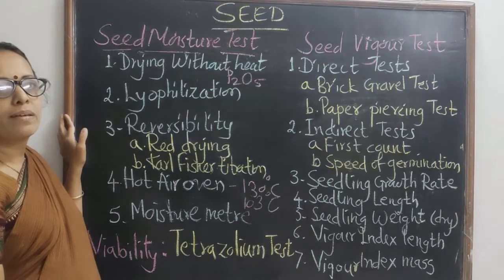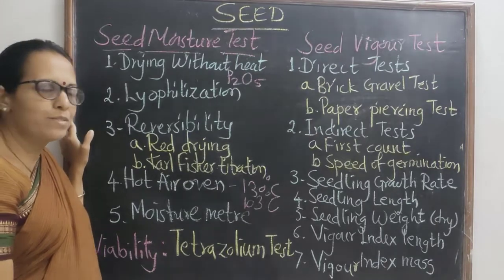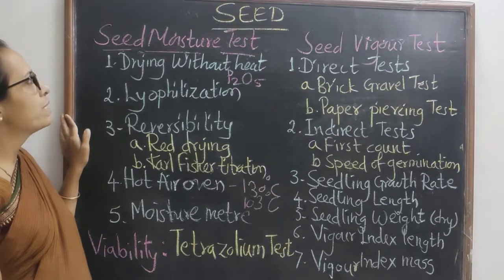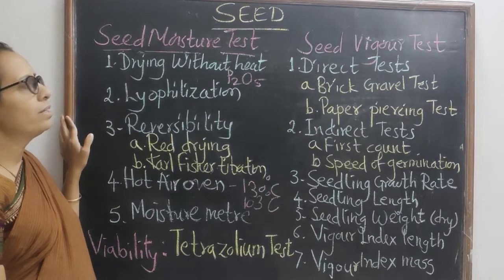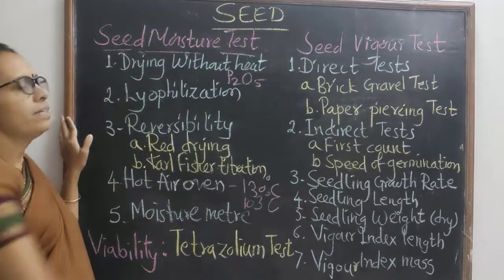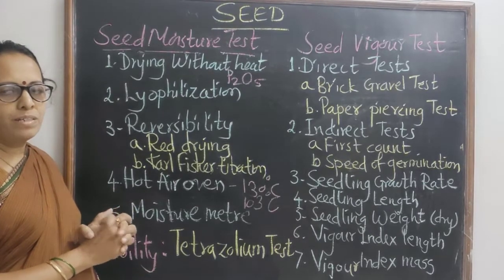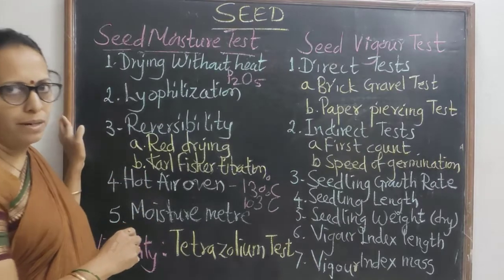After studying the seed germination test, we are now going to discuss the different tests which are carried out to calculate the moisture in the seeds, which we simply call the seed moisture test. Moisture is one of the important factors when storage or germination is considered.